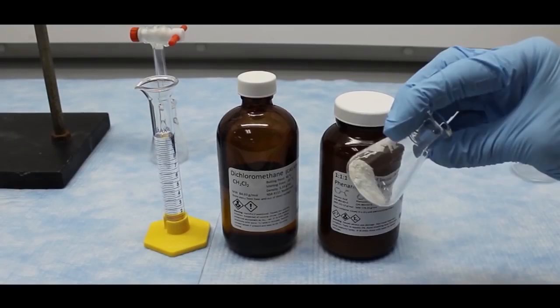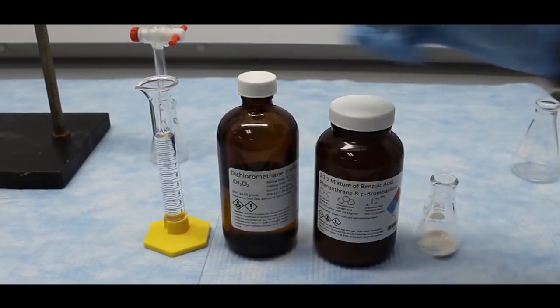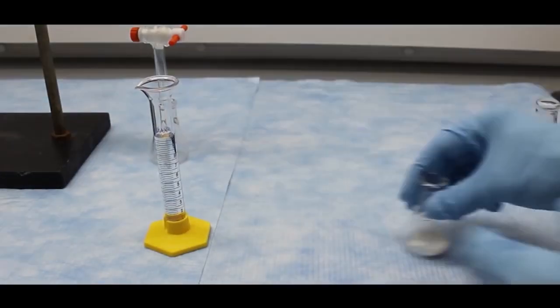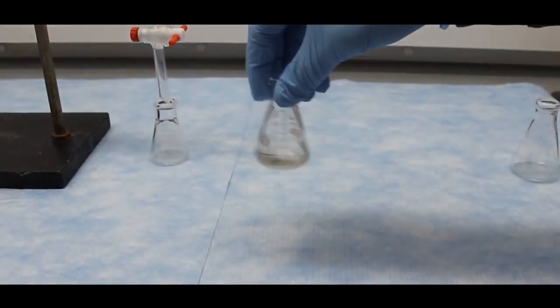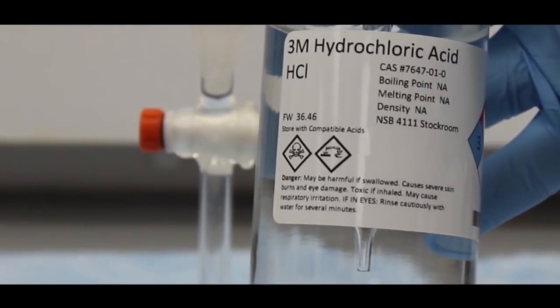Here I have a 1:1:1 mixture of benzoic acid, phenanthrene, and p-bromoaniline. I'm going to dissolve the mixture in 10 milliliters of DCM or dichloromethane. I'm going to add the solution to a separatory funnel. Next, I'm going to add approximately 5 milliliters of 3 molar hydrochloric acid.